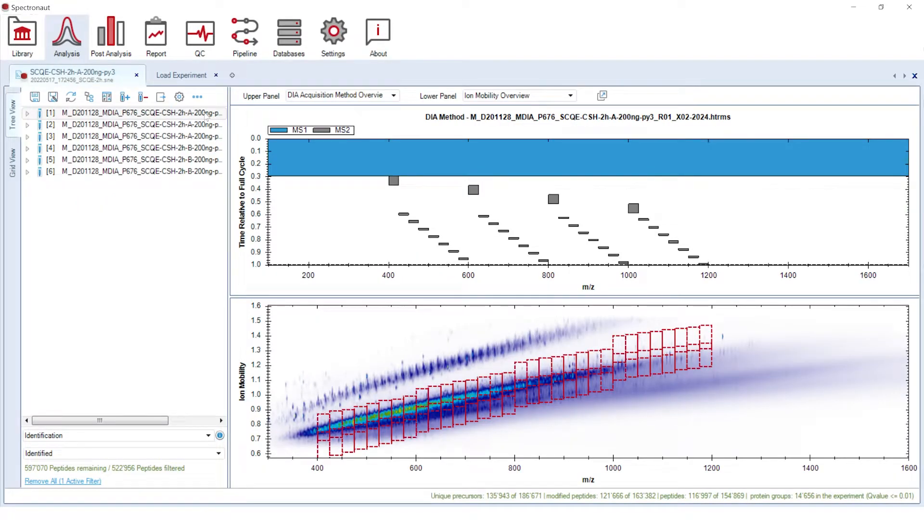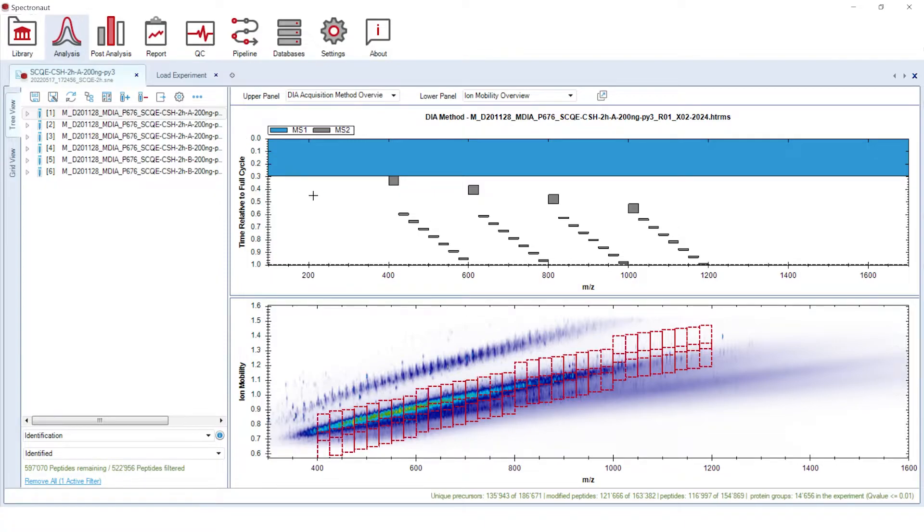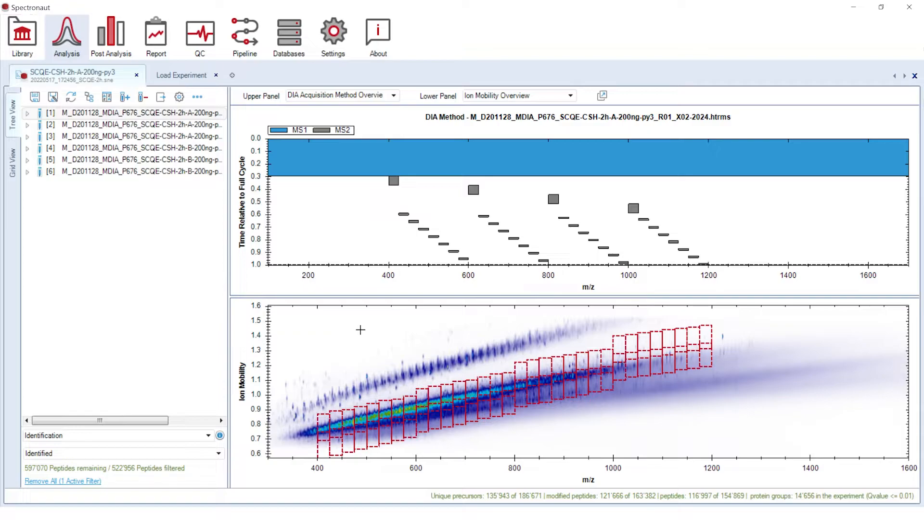Once the processing is finished, you can review different information derived for your data at run, protein group and precursor levels. One of the new visualizations on the run level is a DIA acquisition method overview, where you can see details on how the DIA acquisition method was constructed. That plot next to the ion mobility overview is a convenient tool for inspection of the correctness of the used method and serves the purposes of acquisition method development and optimization.